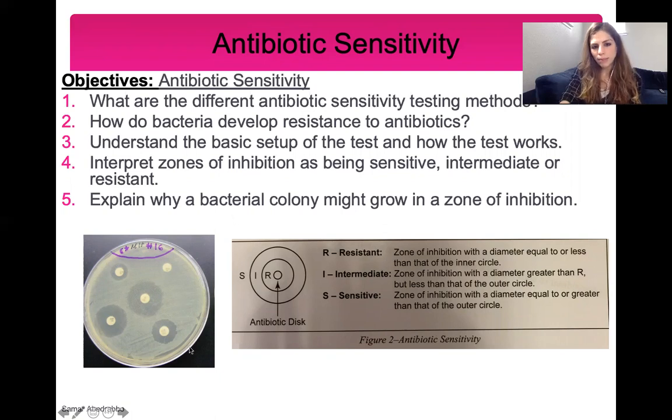And sometimes you see a colony growing in a zone of inhibition. And if you see a colony growing in a zone of inhibition, that means that that bacteria developed resistance, which is not a good thing. It's not something we want.